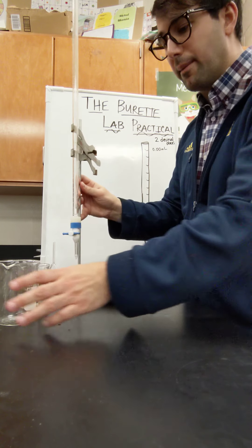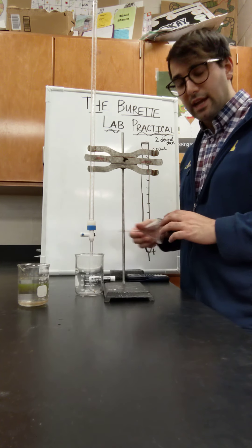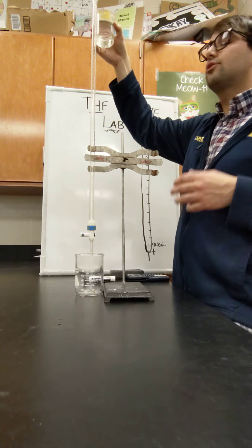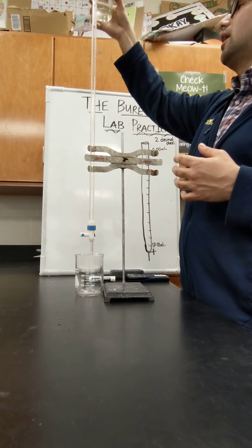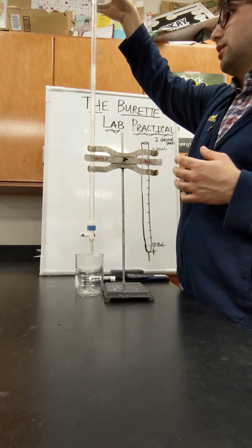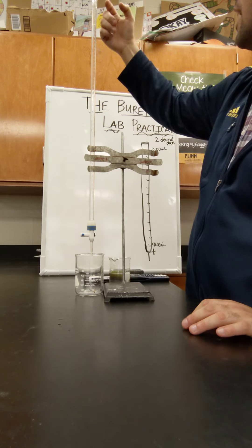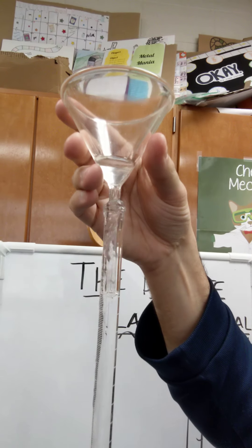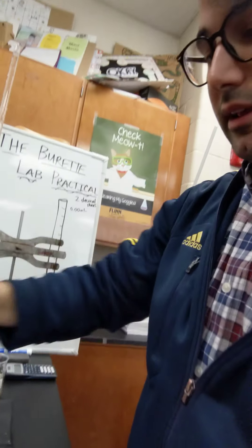I'm going to push the burette up a little and put my bigger beaker underneath to trap any liquid that falls through. I'm going to take my funnel, put it through the top, and pour liquid into my burette. Eventually you're going to need goggles on — if you're working with acids and bases. Right now I'm working with water so it's okay. I filled it all the way up to the top but I have some liquid in my funnel, and if I pick it up it's going to overflow. You don't want that to happen when working with acids and bases.